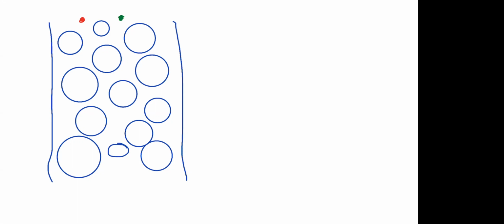So the question is, how could these compounds pass through the column? And we can see that maybe this green molecule enters the column and it flows through these two particles, and maybe then through these two particles, and here and here and here. It goes fairly straightforward through the column and then exits the column somewhere over here.